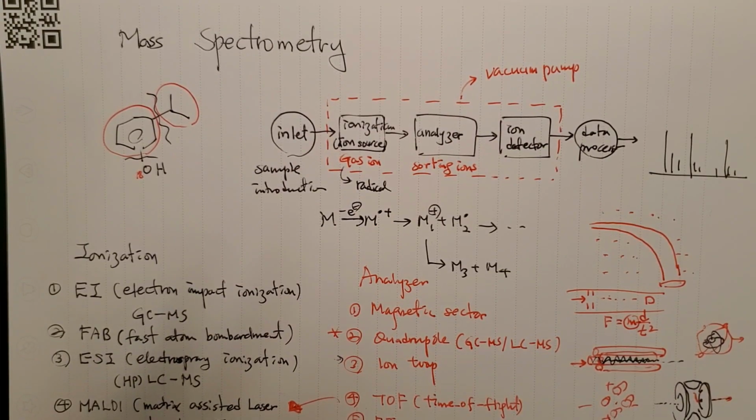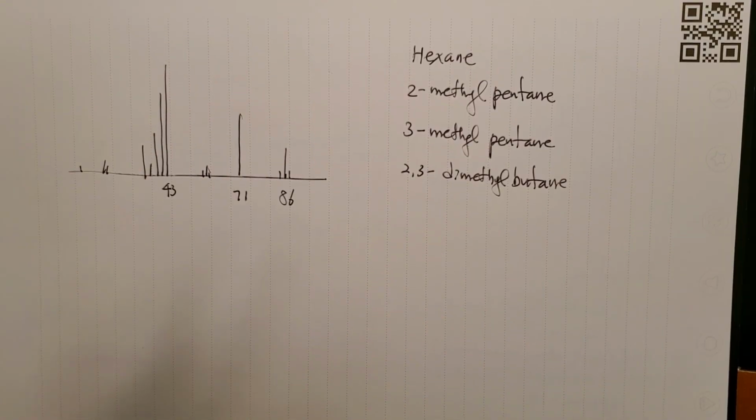Hello everyone. Today we'll tackle some spectrum of mass spec and infrared spectroscopy. Alright, first let's take a look at this mass spec. Which one of these compounds gives this mass spec? Pause the video and try to figure it out.